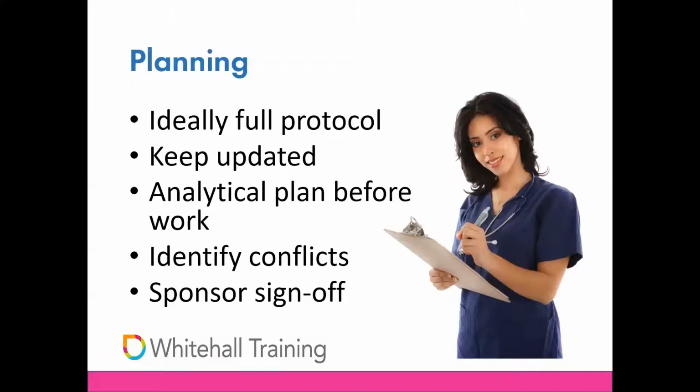The types and numbers and timings of samples that are going to be taken ought to be confirmed through the protocol and analytical plan, and any special handling that they might need because of the types of samples you're dealing with have to be built into the process. So this might include non-standard preservatives, protection from light, fast processing, things like that.